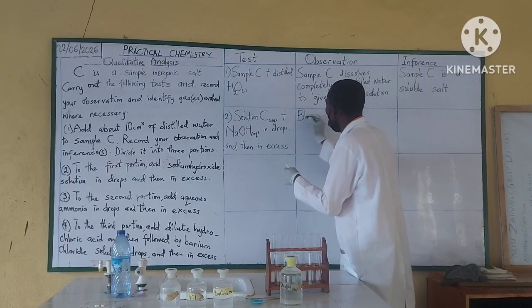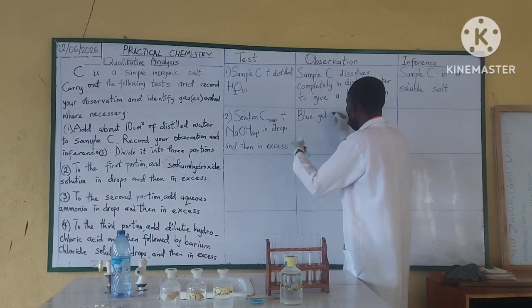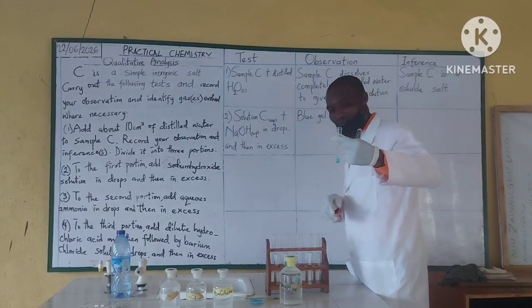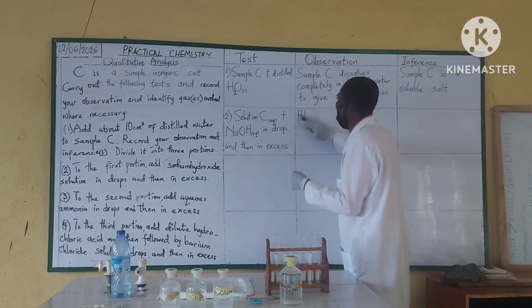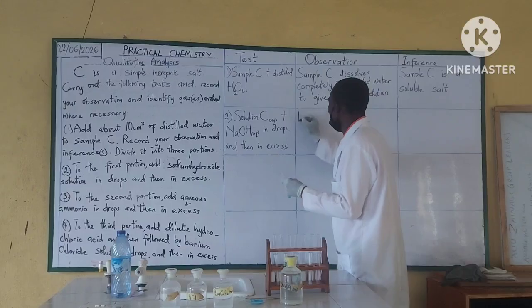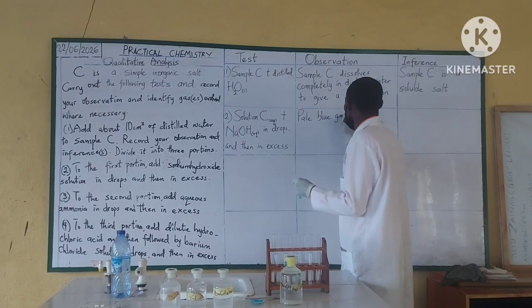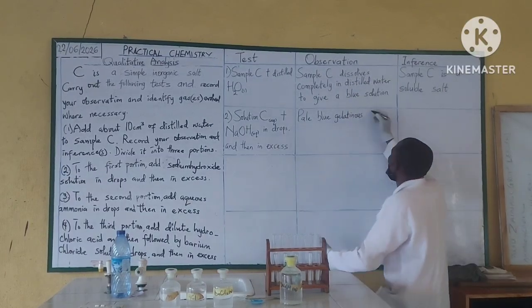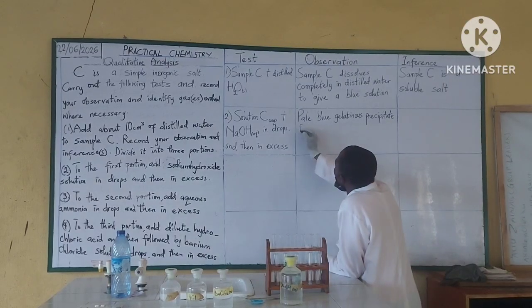Rather, pale blue, because it's not deep. Say pale blue gelatinous precipitate.